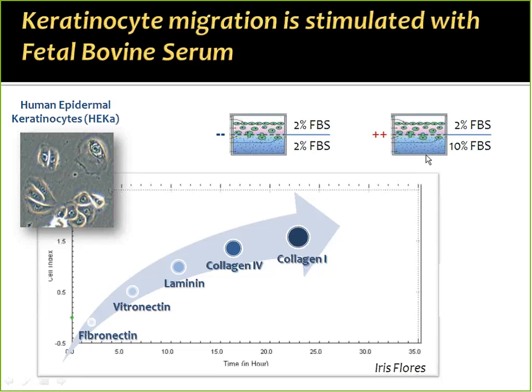But fibroblasts and stem cells seem to prefer a longer starvation period in order to migrate to the other side. That was one of the things we discovered: your different cell types are going to require different conditions to give you a nice migration result. Fibroblasts and stem cells are hardier cells, so they can be starved for a longer period of time before they are coaxed to move over to the bottom chamber.